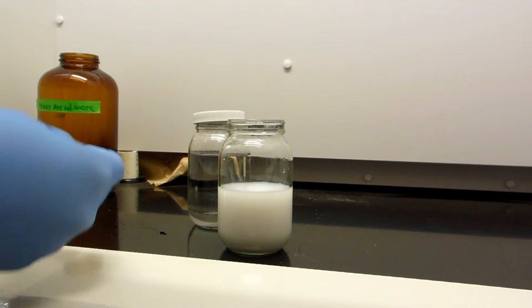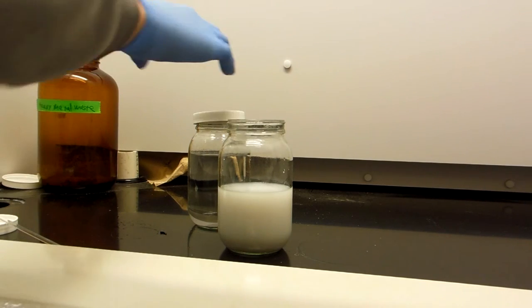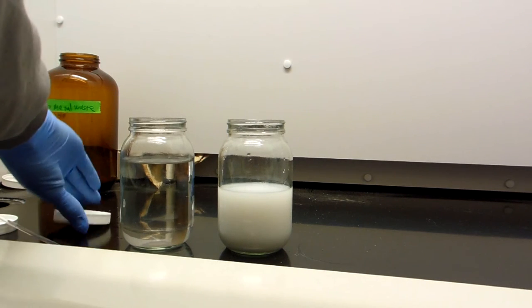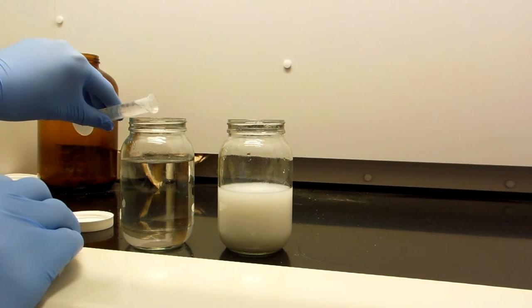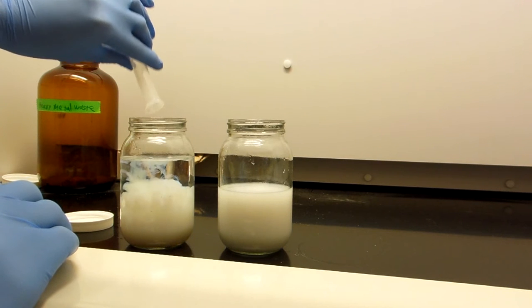I've just finished stirring it in, and I uncapped the second jar. And instead of using a pipette, I directly pour the 10 milliliters into the jar. You can see the same beautiful reaction happen.